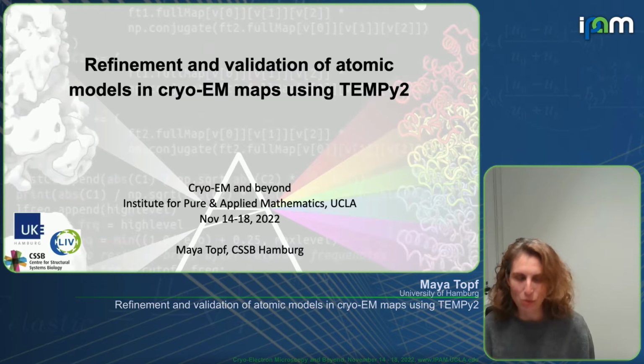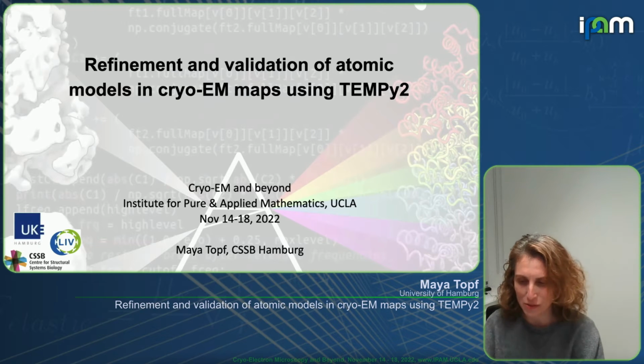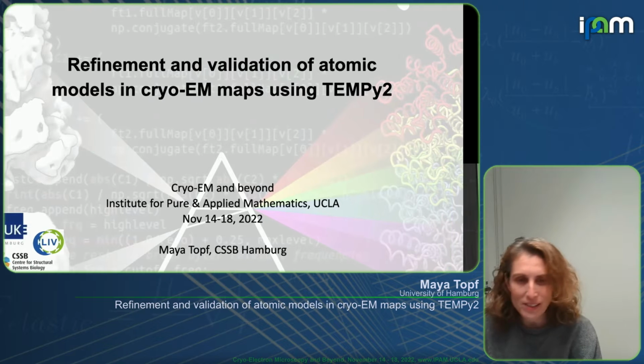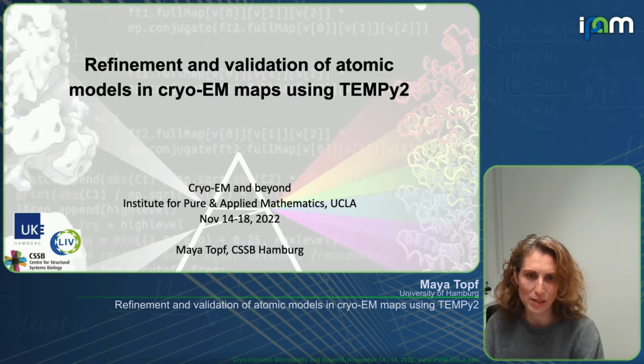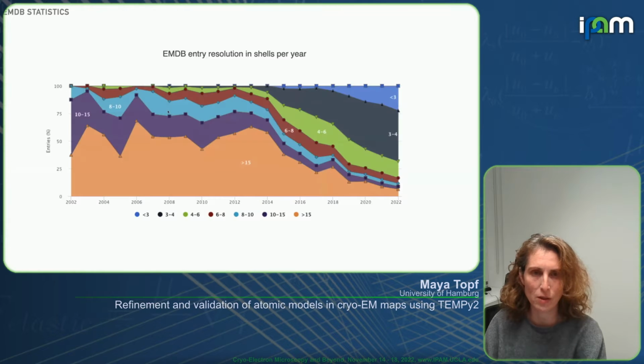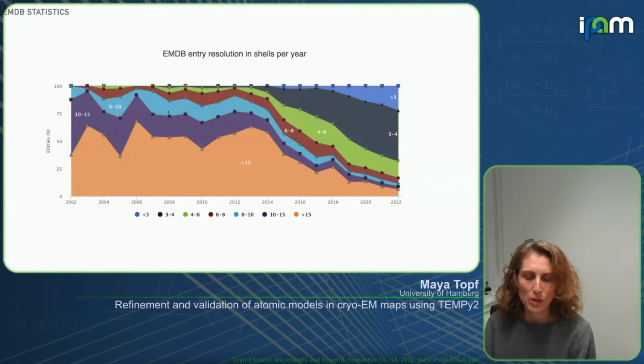So I started working in the modeling in this field nearly 20 years ago. And so the field has changed a lot, and I want to show you a few things that we showed and developed over the years and what we have currently in our TEMPy2 software. Let's see if it moves. Just a second. Okay. So I have not seen all the talks, so I don't know who has shown what, but you probably know and understand the current state of cryo-EM.